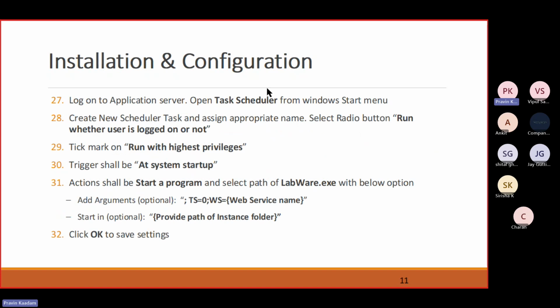The next final step is to create a service in the form of a task scheduler. So we'll log on to the application server and open task scheduler.